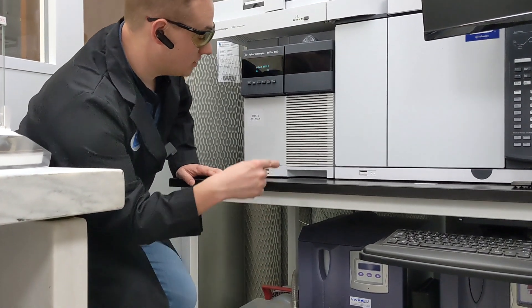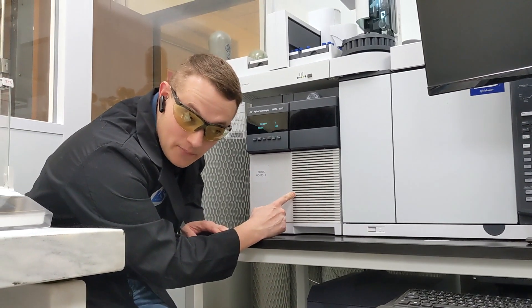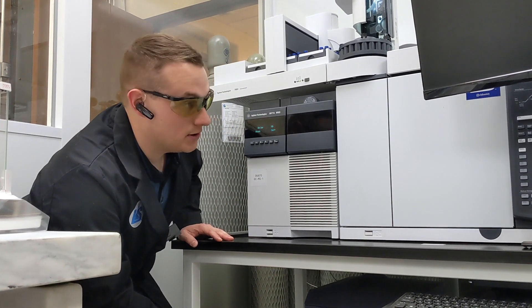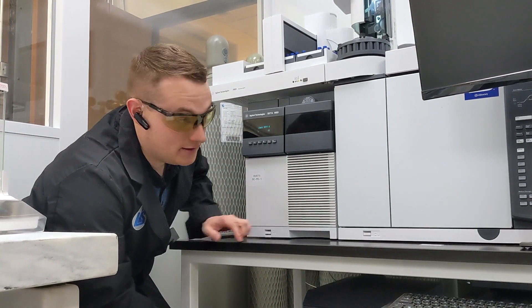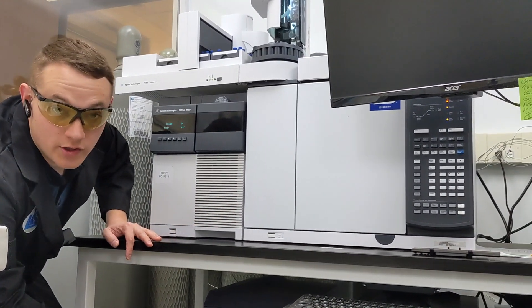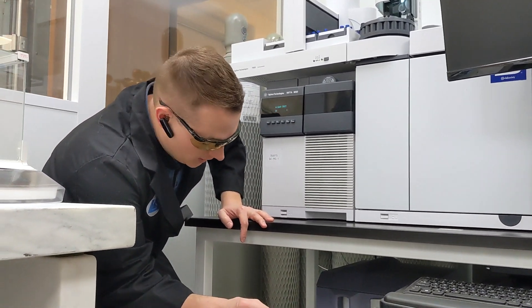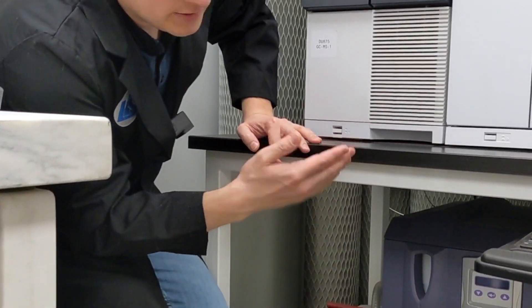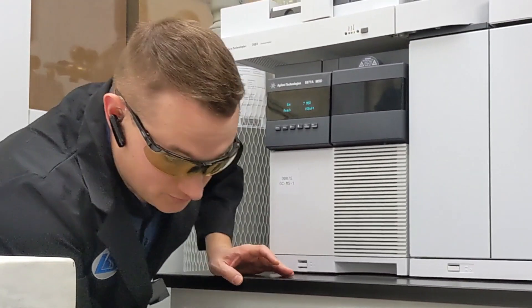Believe it or not, there's actually a turbo molecular pump inside of here — I can hear it, I don't know if you can — inside the mass spec portion, which keeps ultra high vacuum. This is a completely dry application over here: dry pump plus turbo molecular pump, because there are no molecules moving around.